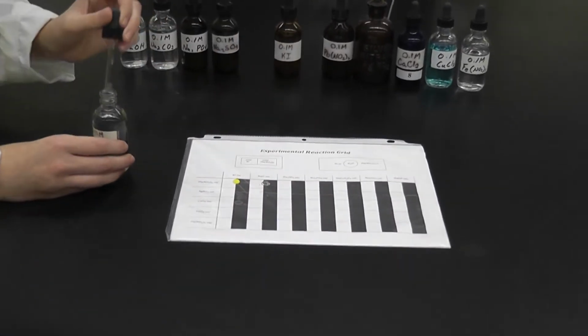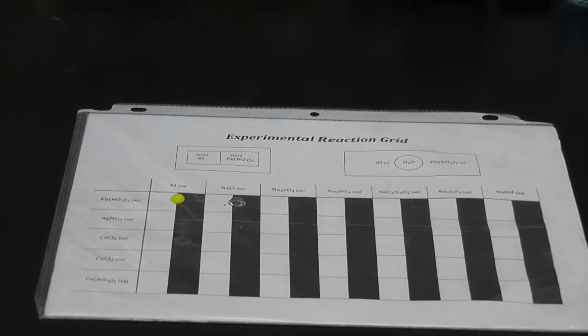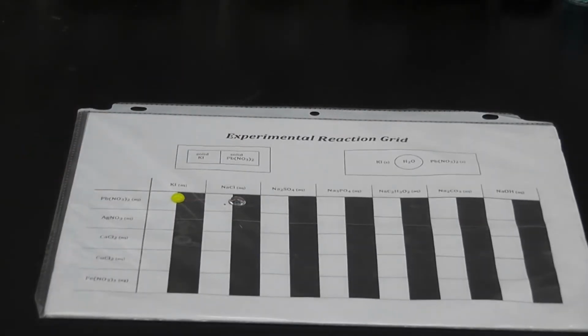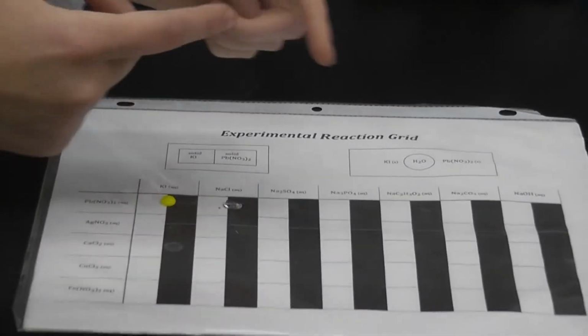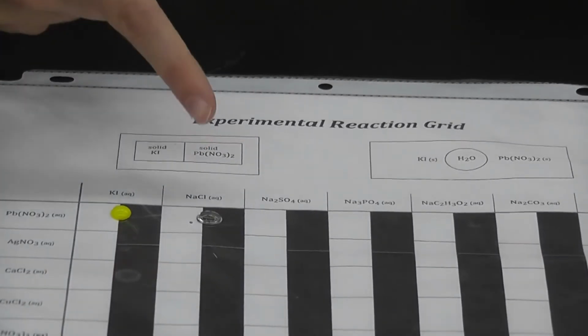All right. Sodium chloride? Yes. And lead-2 nitrate. So we're continuing down this lead-2 nitrate line. And we're mixing each one, just matching them up. Okay, so observe your reactions here for this one.